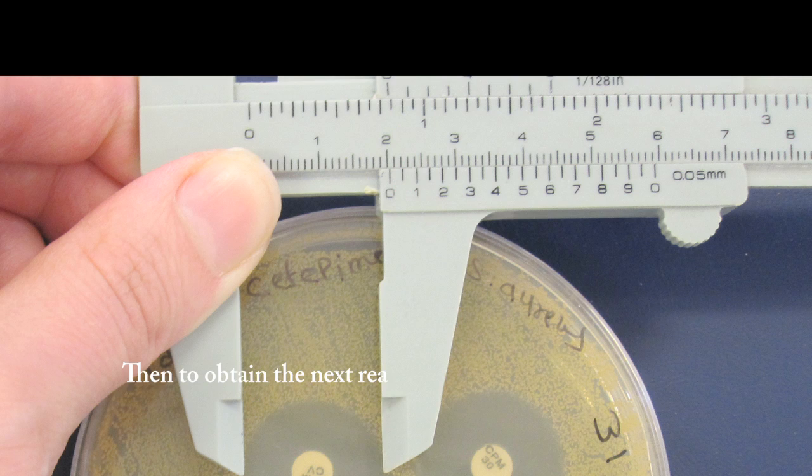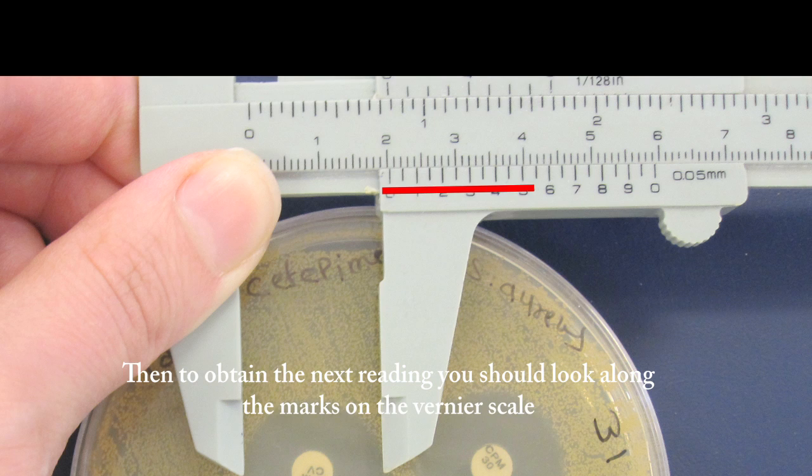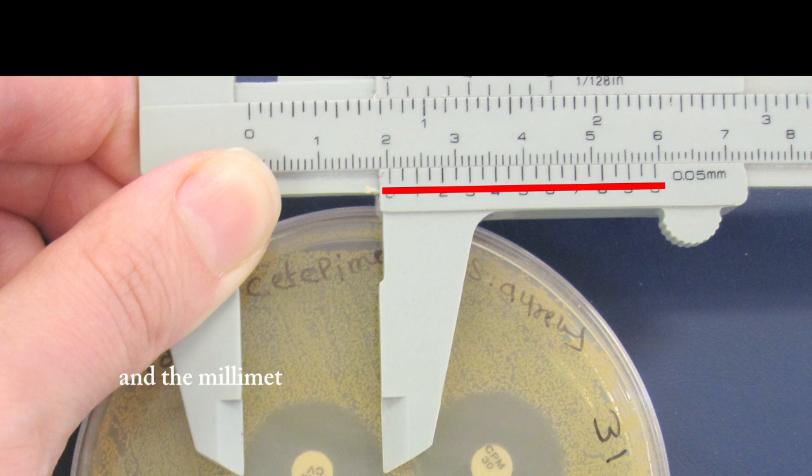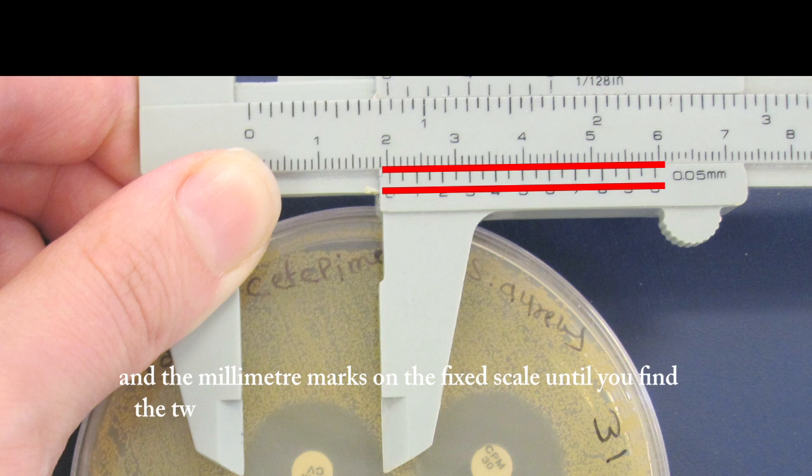Then, to obtain the next reading, you should look along the marks on the vernier scale and the millimetre marks on the fixed scale, until you find the two marks that most closely align as a straight line.